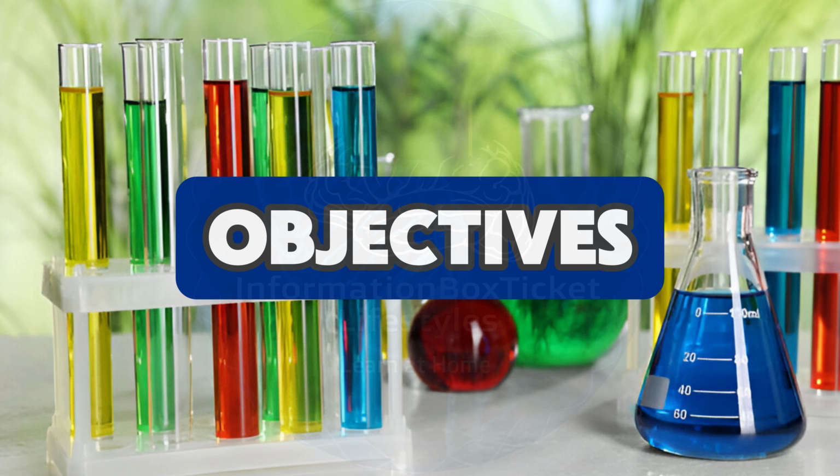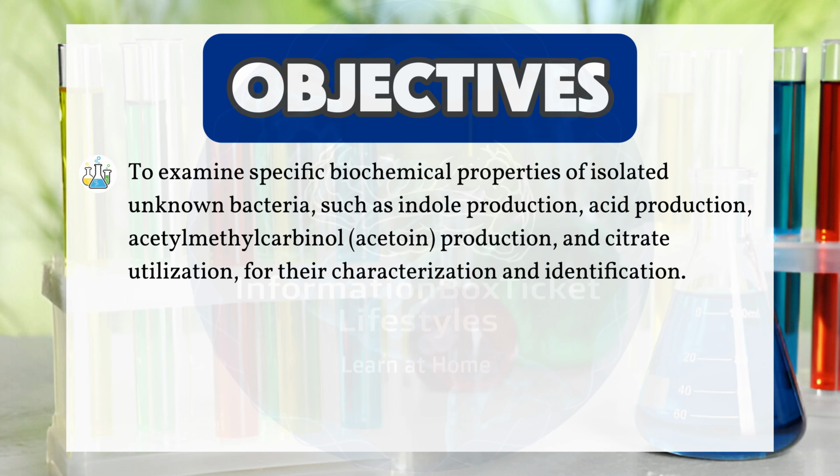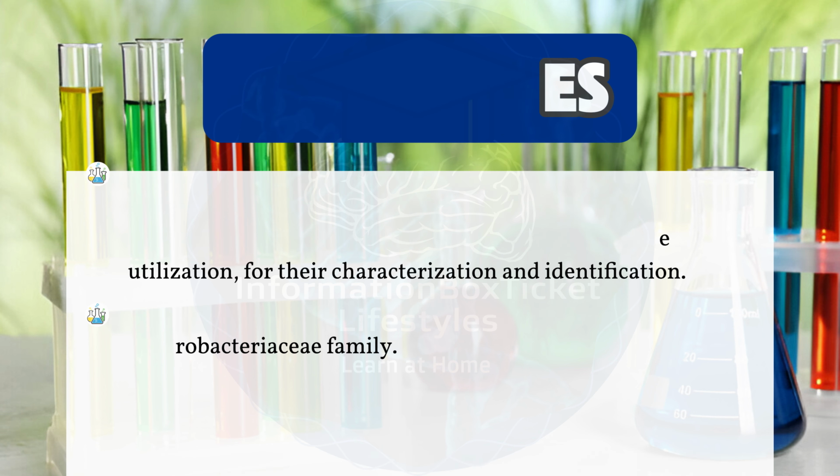Objectives of IMViC test. To examine specific biochemical properties of isolated unknown bacteria, such as indole production, acid production, acetyl methylcarbinol, acetoin production, and citrate utilization for their characterization and identification. To selectively differentiate and identify members of the Enterobacteriaceae family.